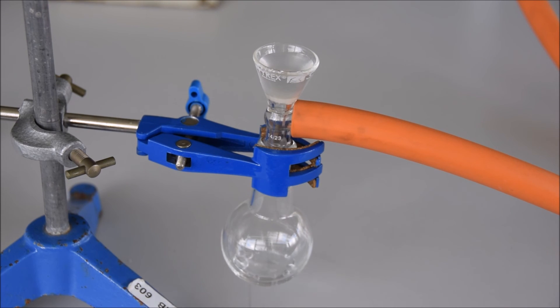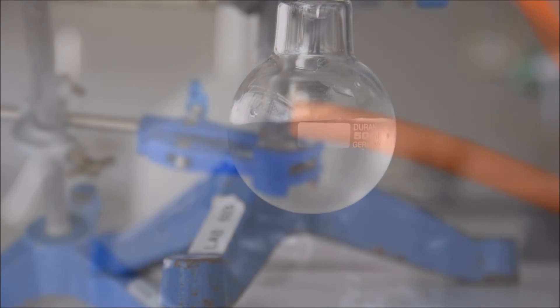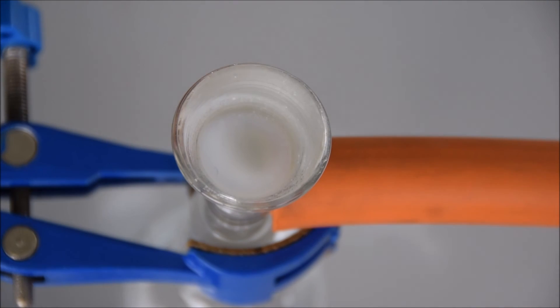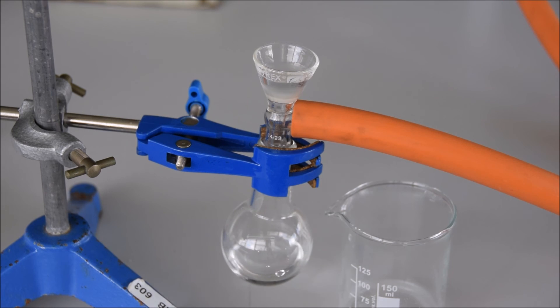Here just for demonstration purposes I show you how slow a fritted funnel is, because that is their other disadvantage. Typically glass frits like the one shown are much slower compared to either Buchner funnels or regular filtration. That is offset against the advantage that they give you much finer filtration, and that's often the trade-off.